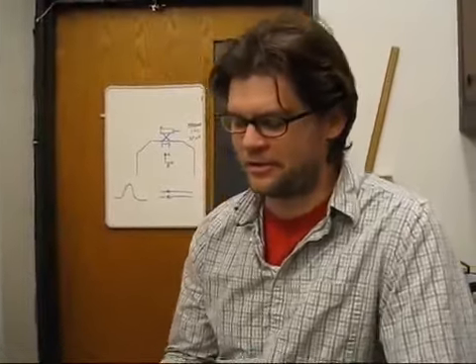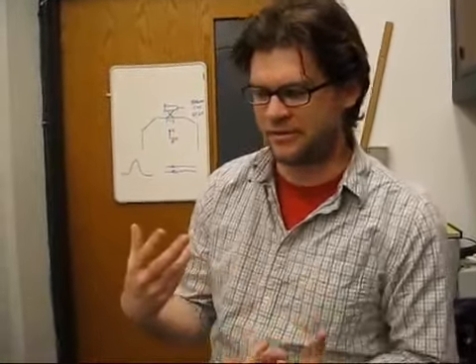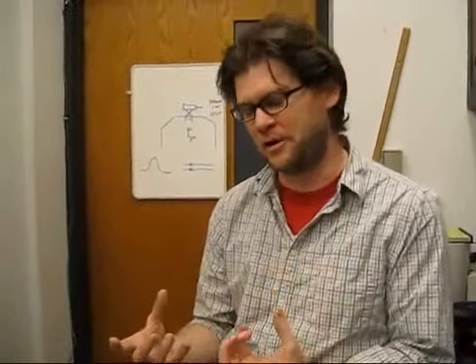So what is it we actually do in this lab? Well, why we're actually buying this laser. The idea is to beat the diffraction limit of light. To give you an example, you remember back in high school biology class, you're looking at some amoeba that you pulled out of pond scum, and you're increasing the magnification of your optical microscope. And you realize there's a point where you focus, but it's still blurry. This is kind of an analogy, but that blurry spot is the diffraction limit.